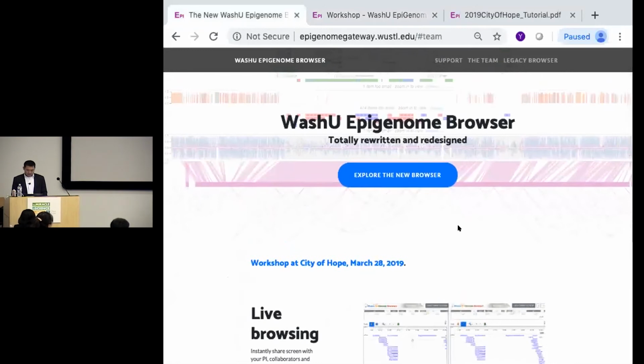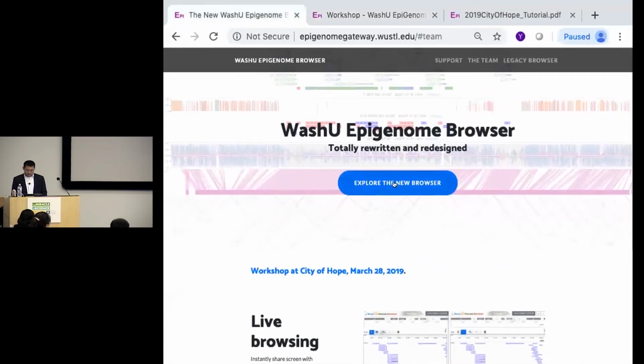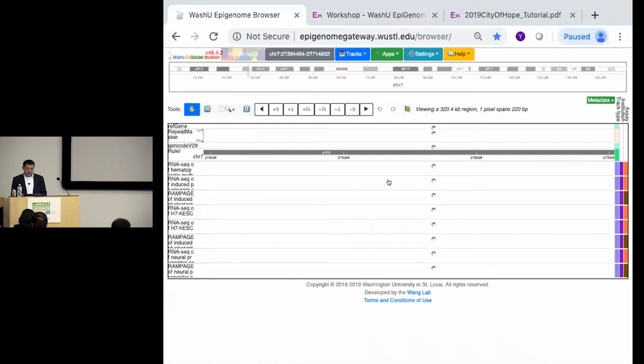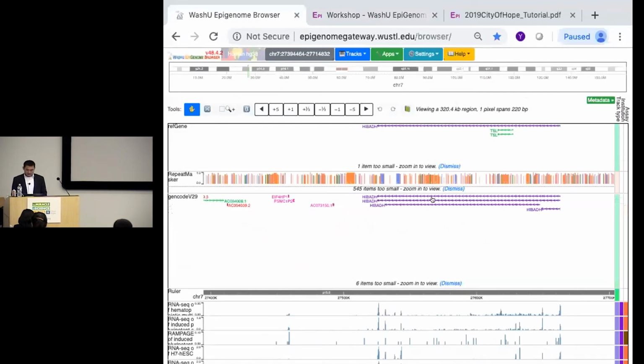Okay, so now let's go to the browser. We're going to click this link, explore the new browser. We're going to get to the actual browser site.